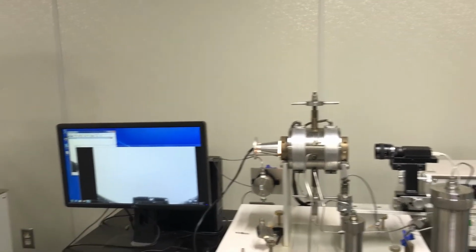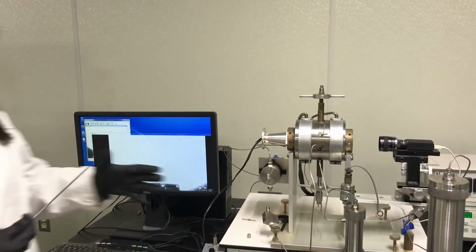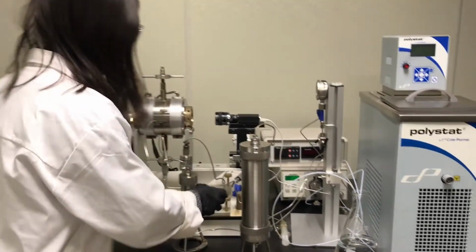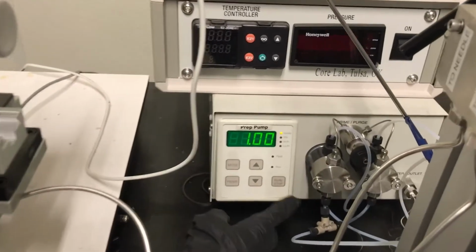And then what we need to do is load the two liquids into the sample. And here is the pump. We can adjust the injection rate.